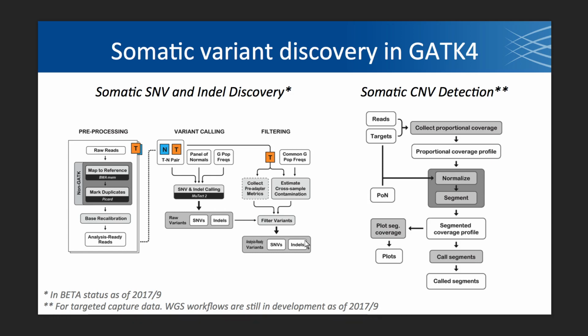Oh, and one thing to mention, and I think Yossi brought this up, is that the pre-processing for the cancer samples is pretty much the same as the germline, except we do not do binning for BQSR.